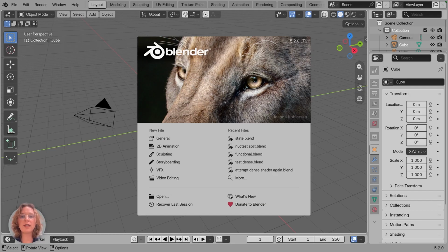The important thing is that the loading workflow is essentially the same for all of these datasets. What changes is how we choose to represent and visualize the data after it has been loaded. We'll start with a multi-channel fluorescence dataset because this kind of encompasses a lot of the basic features, and then I'll show how the same controls can be used for dense FIB-SEM data and for a time series dataset.